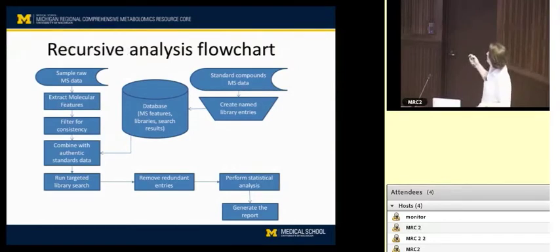Then in our particular workflow, we take the library of the authentic metabolites and combine it with the data, and then we again do an alignment step where we're looking at how well does a library entry align with your data, and is that alignment sufficient to call that an identification? And I'll go into more detail about that later as well, which is this part here.